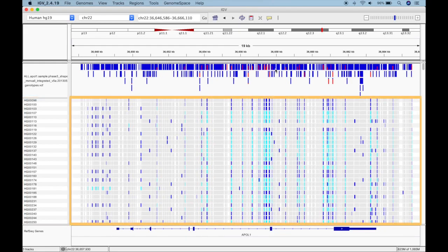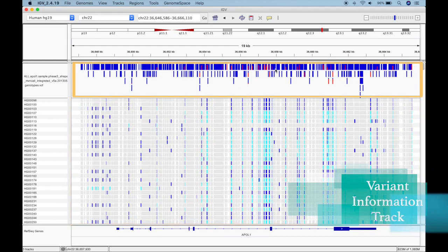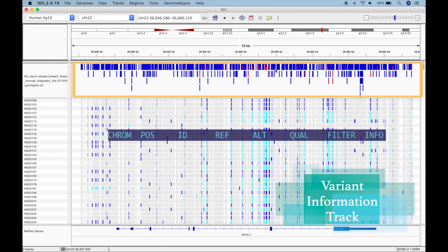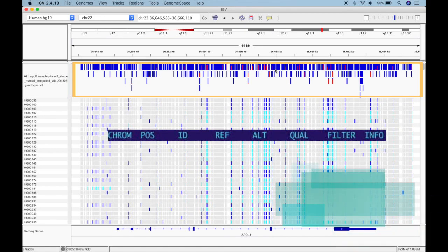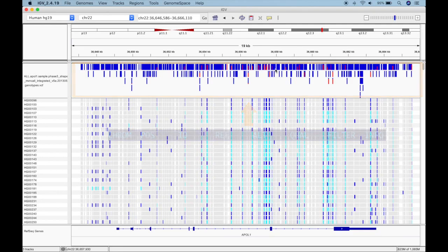In the center is the genotype data for each sample. Above the genotype data is the variant information track. Remember those 8 required columns in a VCF? This track displays the data from those 8 columns for every variant. This means that if you load a VCF without sample data, this track stands alone.